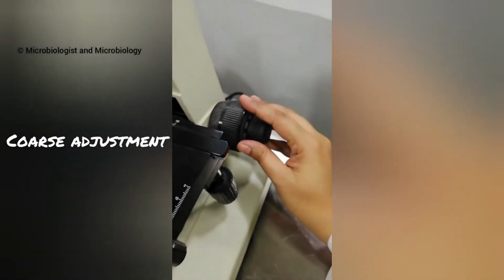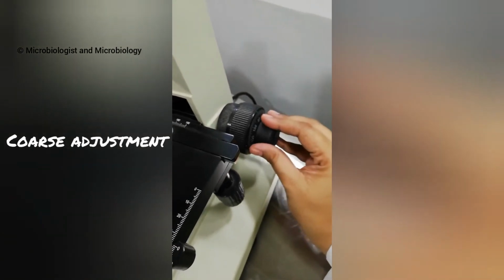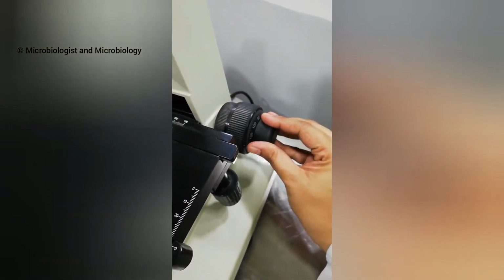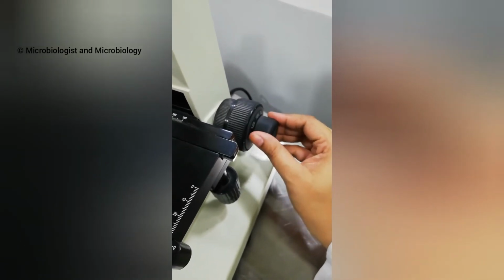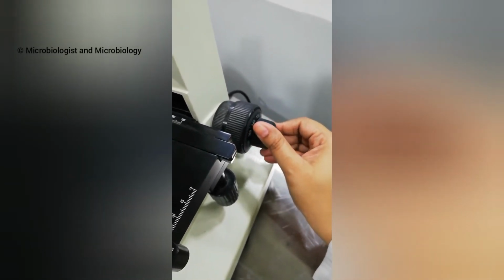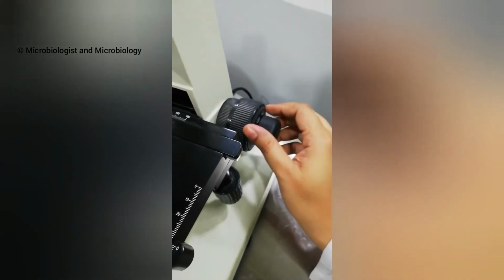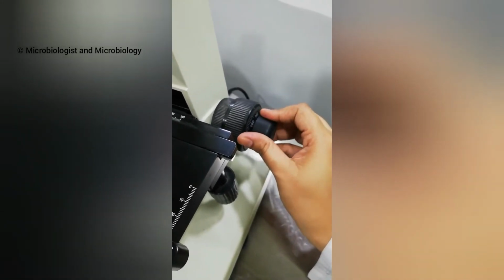Below the stage on one side there are the stage moving controls. One control moves the stage back and forth. The lower control moves the stage right and left. These dials move the stage up and down to help focus the specimen. The fine adjustment moves the stage in much smaller increments.